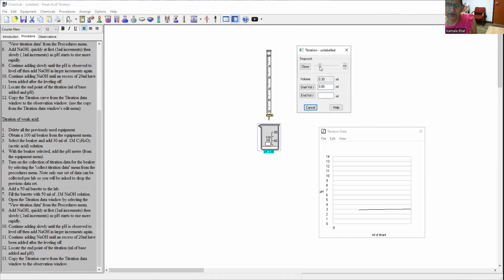And so start the titration, and you can see as it goes on, you will see that the titration curve is coming up. And also, you have to remember that when you are doing a pH meter titration, you will see a slight curve in the front. And then as the titration proceeds, I will discuss both these two curves that you are observing under your graph. So let's finish the experiment first, and then make sure you get a nice S curve. And then you close the graph.